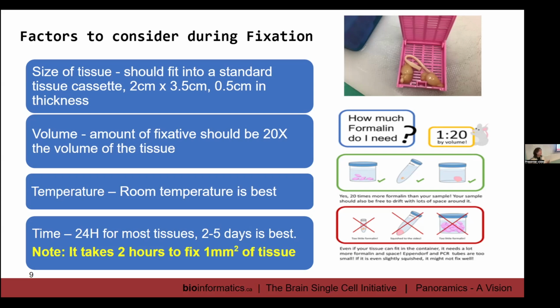Some people can do maybe 4 hours, but that's usually for biopsies 1 millimeter by 1 millimeter, centimeter in length. And those biopsies too, it depends on the composition of the tissue. So this is what I'm going to touch on now. So as you know, up there, that's brain. Brain is highly lipid compared to, let's say the kidney. Kidney just has a little capsule around it that protects it. But once you cut that open, formalin is going to flow through there freely, no problems. It's going to get in.